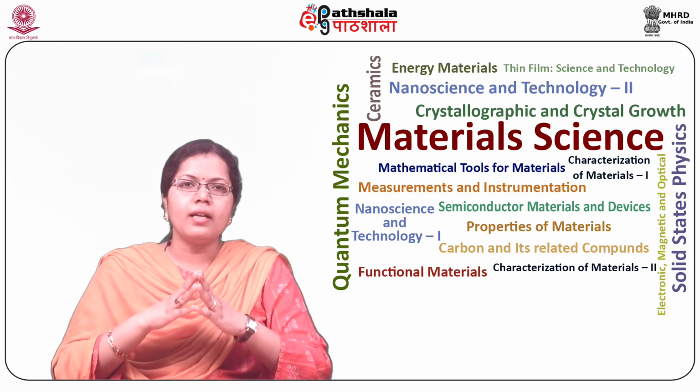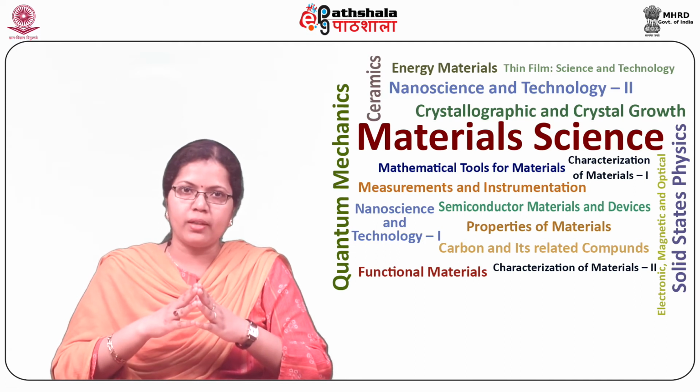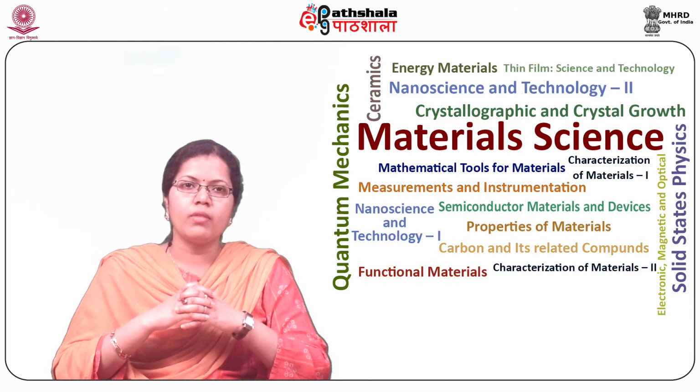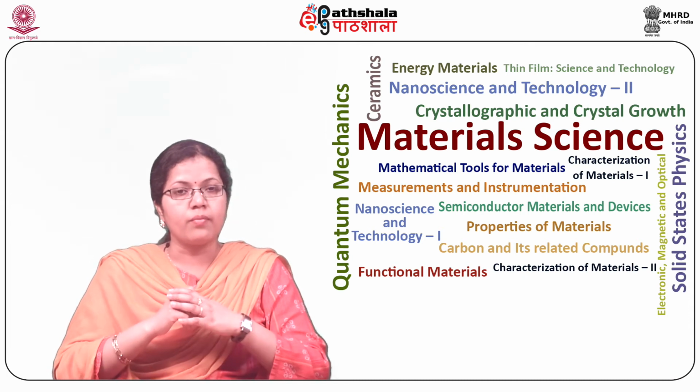Now, let us understand the applications of dispersion staining microscopy. The applications of dispersion staining technique are as follows. First, differentiating the components present as mixture.